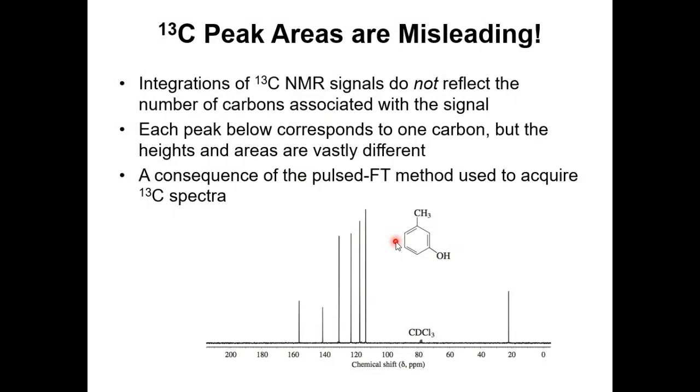Benzene has 6, okay? Then one methyl group, so they have 7 carbons. And all these 7 carbons are unique. So you actually can see 7 carbon 13 peaks, 7 of them. So you know that for every carbon, you have one peak. But you see the peak area, the peak intensity, they're quite different, okay?